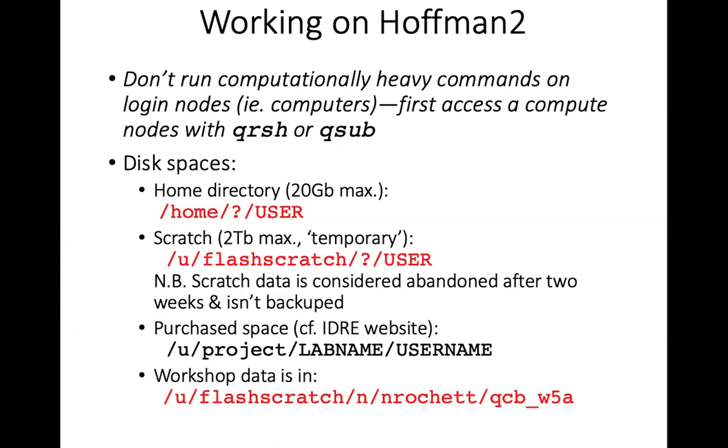Generally, when you want to download programs or files from the internet to the cluster, you have two ways. You can download them directly by clicking the link in Internet Explorer, Firefox, Safari, whatever you use. And then that's going to be downloaded to your laptop, and then you can upload that to the cluster with SCP, for instance.